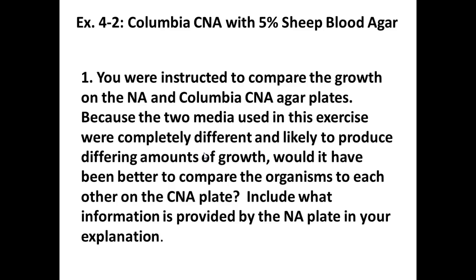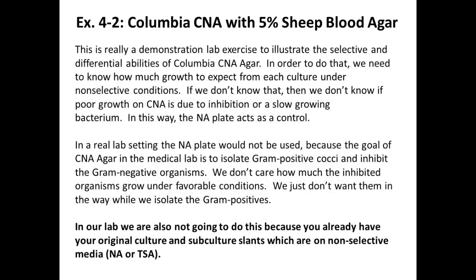No doubt. Okay, so again, we didn't do nutrient agar plates because remember, we've been doing a slant instead. So you guys inoculated your slant. You'll see that you can't see hemolysis, because there are no red blood cells in that media, and there's nothing in it to stop them potentially from growing. So you should see nice, good growth.